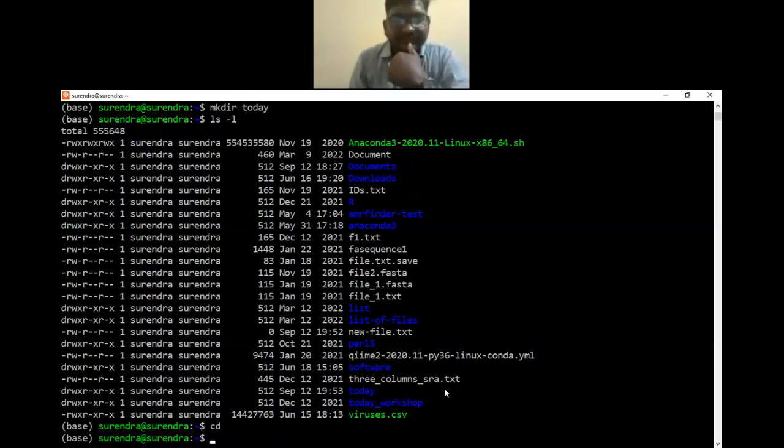You should not get the error. Okay, yes, sir, got it. So when you did the cd command, it took you to your home location, your user directory. You were somewhere inside the root location before. That's why you got the permission denied message.